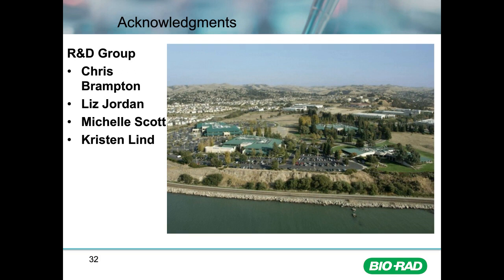Another question, this one from Sigrid, who wants to know, if you would analyze T cells in the context of a clinical trial with an immune checkpoint inhibitor, but you have to work with frozen PBMC, would you do the analysis immediately after thawing, or would you first incubate or stimulate the cells?